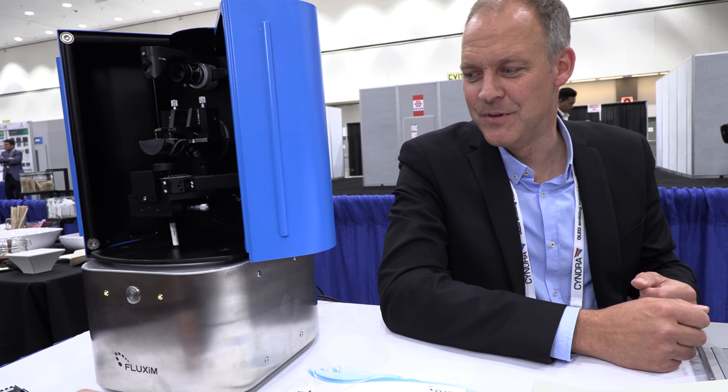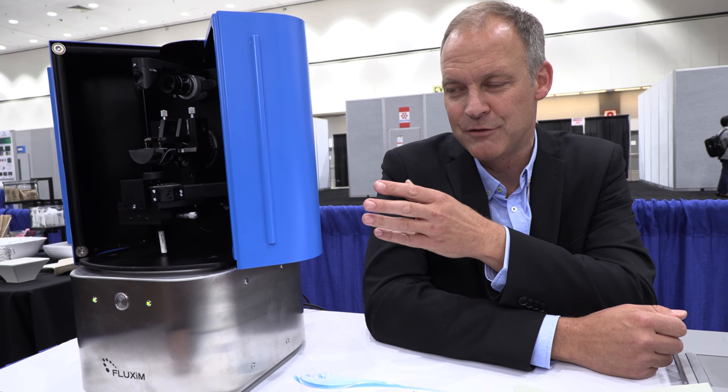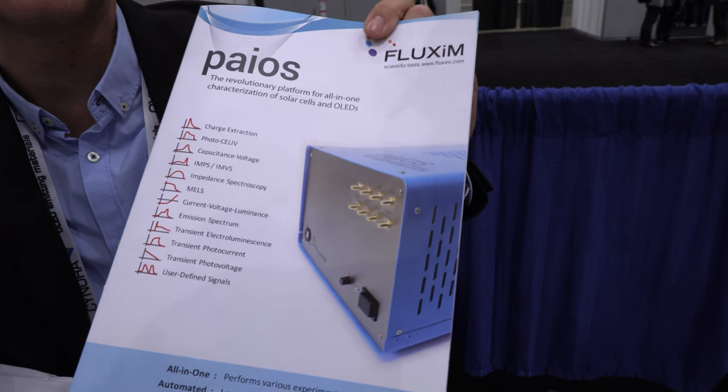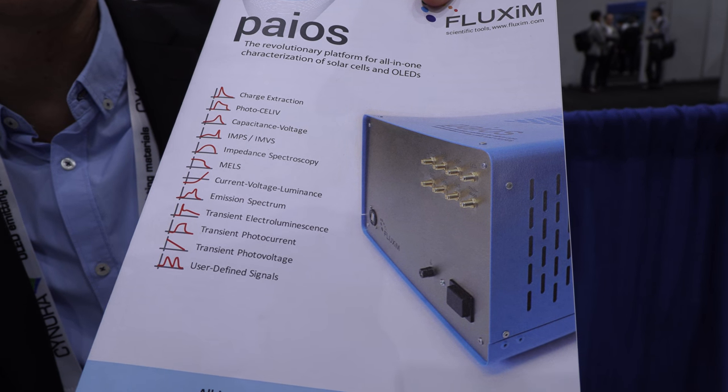And how many did you make so far? This one is brand new because it's a second prototype and we are delivering in two weeks. We're delivering to the customer for this other measurement equipment.